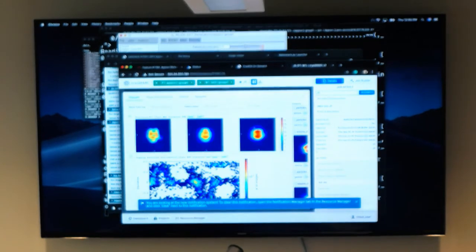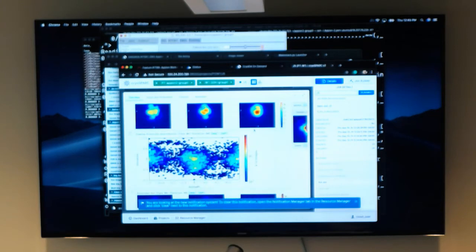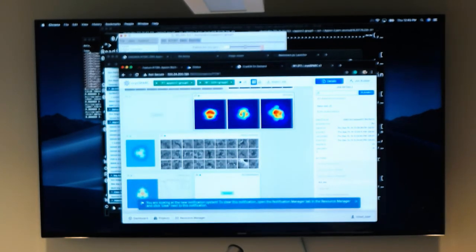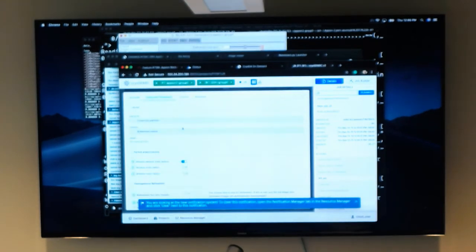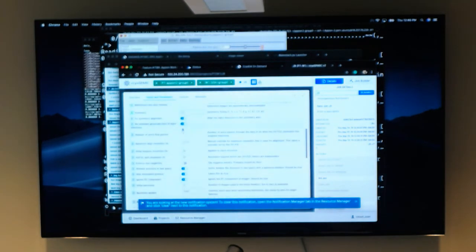When the ab initio finishes, I'll start another refinement run with this ab initio model. But you can say, I bootstrapped with an initial model, am I worried about model bias? You can see in here that I already low-pass filtered my initial structure to 30 angstroms, in the sense that if I achieve resolution beyond that, it's not coming from my initial model. That's why I'm saying certain programs have default settings that make it easier for you, but you should still know what it's doing so you have a better appreciation.